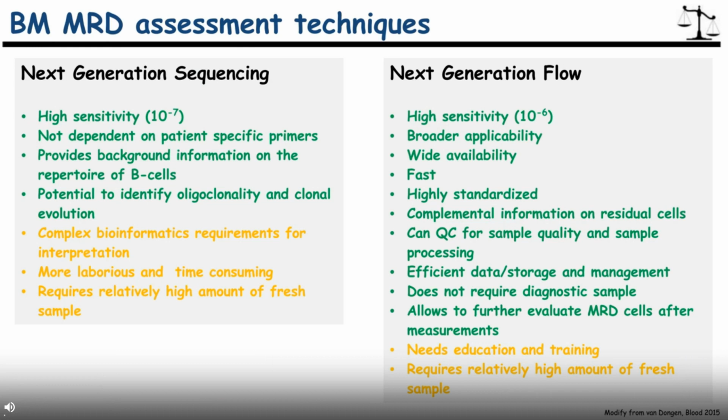A side-by-side comparison of those methodologies looking for the disease in the bone marrow will allow us to identify their respective strong points and also their limitations. In general terms, they are both extremely efficient techniques that allow highly sensitive detection of MRD levels, while differences are evident when they look into availability, to some extent applicability, time required until results are generated, relative complexity, and perhaps cost. One of the strongest points of molecular-based techniques is sensitivity, always perceived as superior to that of flow cytometry.